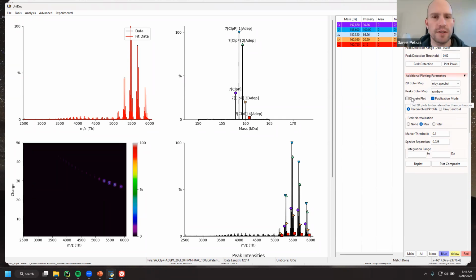So a question for the visualization here. What I see is mainly the bound versions now, and then yeah, there's the apo too. Can you highlight which comes from which file? Especially when you have this control treatment situation.